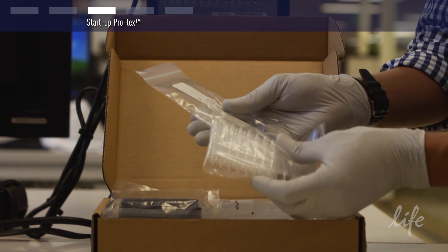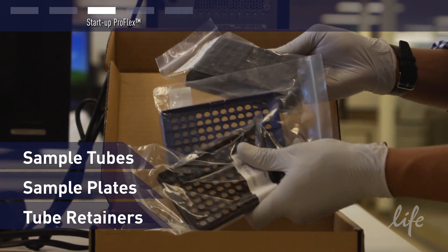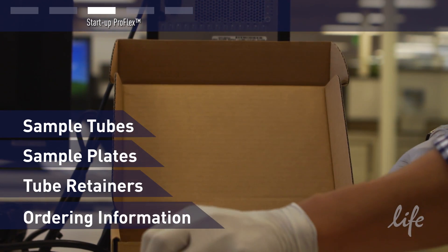Open your starter pack which contains sample tubes, plates, retainers, and trays. Note the enclosed information for use and ordering additional plastics as needed.